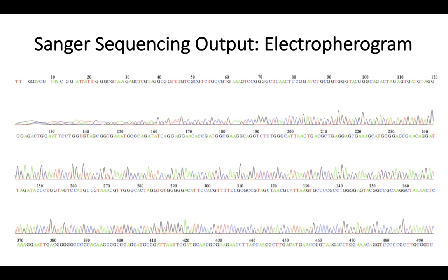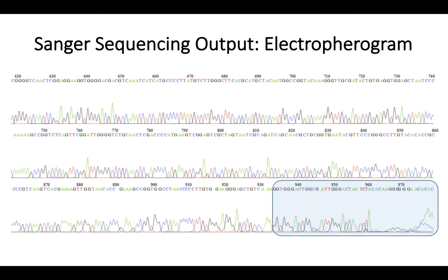Using your background on how Sanger sequencing works, consider why the signals are not particularly strong or distinct towards the beginning of the sequence. This is generally the case for the end of the sequence as well. We can continue with our analysis by trimming off these sequences with ambiguous signals using Mega software.